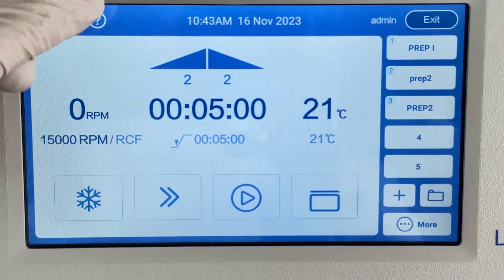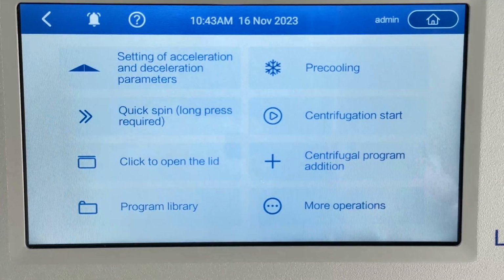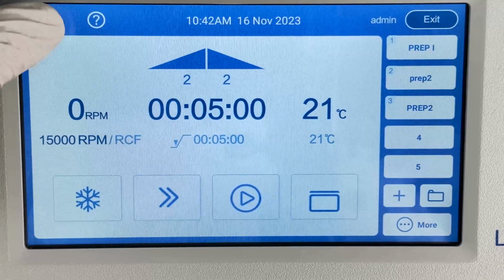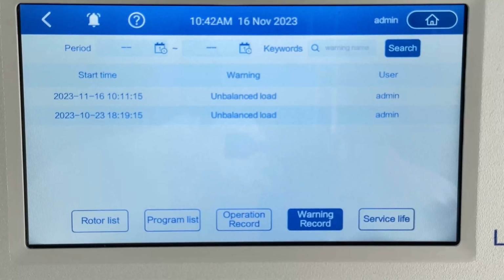If you ever get stuck, just press this button here and it will tell you what the features are of the home screen. If you want to check how the machine's being used, just periodically check the alarms, and you can see that there's been some imbalances, so it suggests that people need some training.